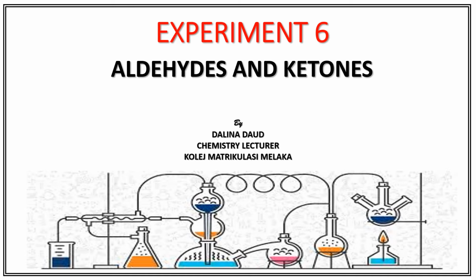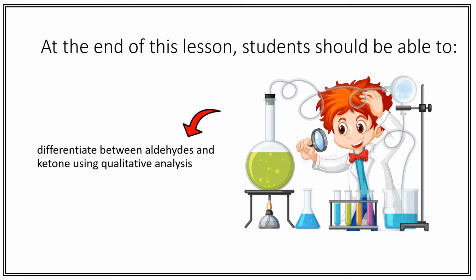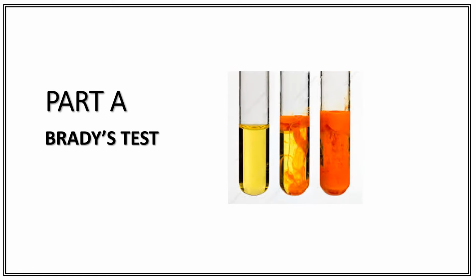Experiment 6. Aldehydes and ketones. At the end of this lesson, students should be able to differentiate between aldehydes and ketones using qualitative analysis.